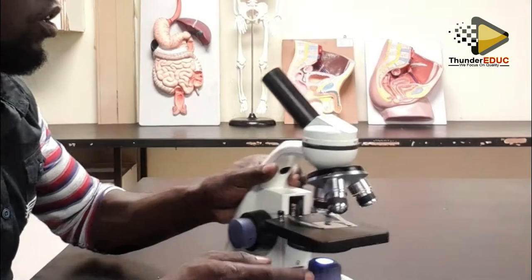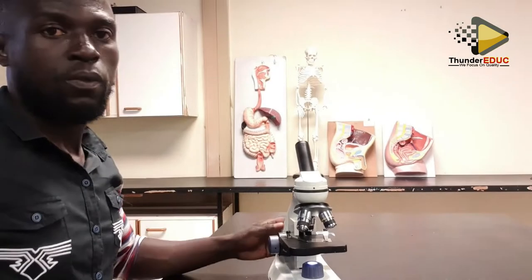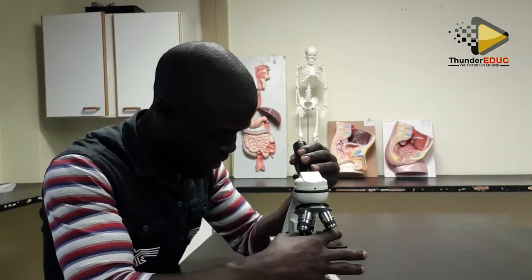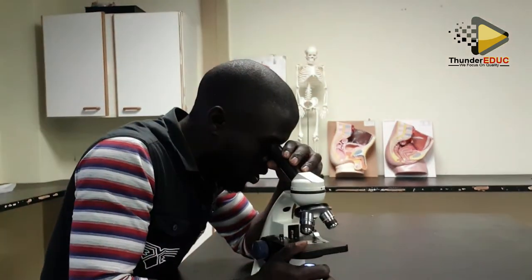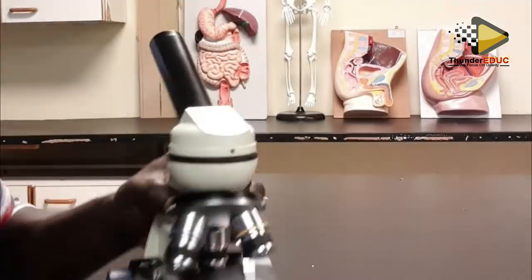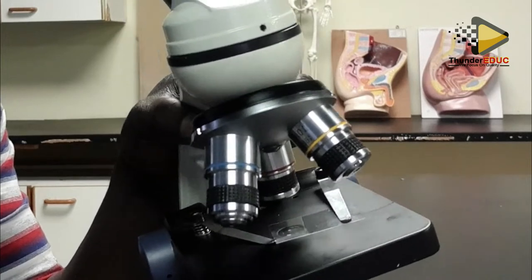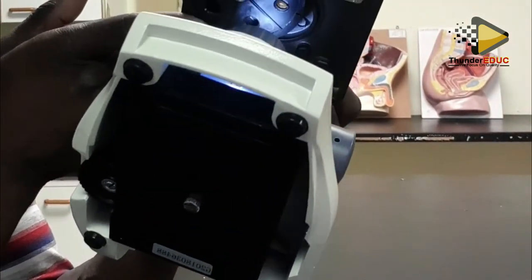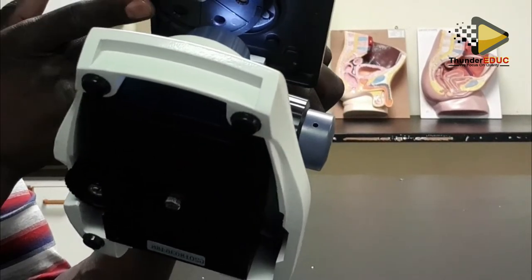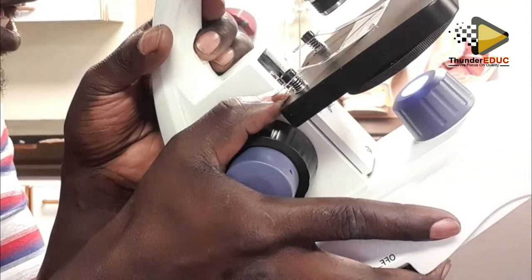After that, you have the eyepiece. Now you can look at it, and then you are able to see what you have put here. Sometimes when you put it there and you can't see, what could be the problem? It means that the hole here is not direct. You have to put the hole in position. It clicks when you put it. That's the hole which is being used. Now, when you look here, you'll be able to see.